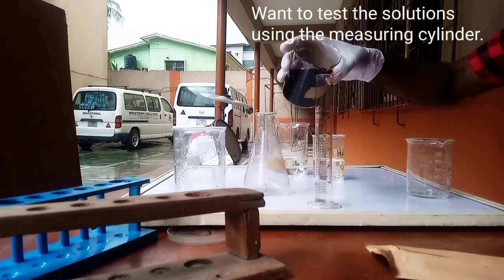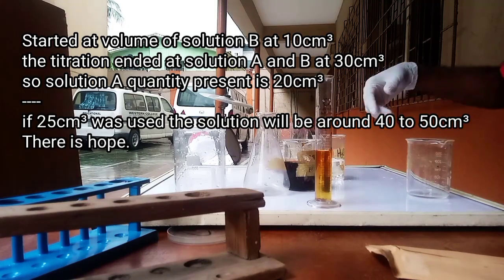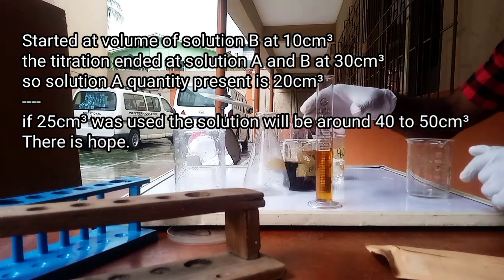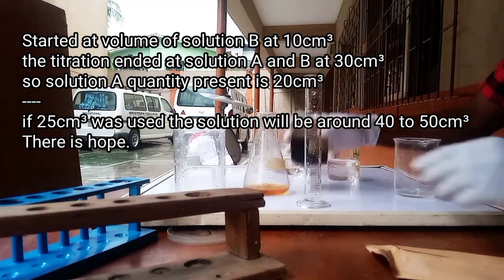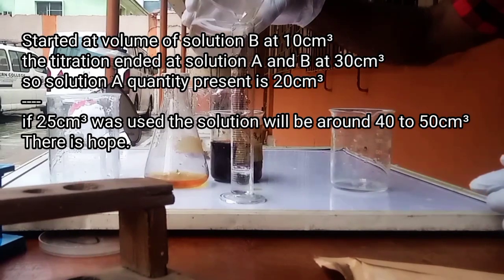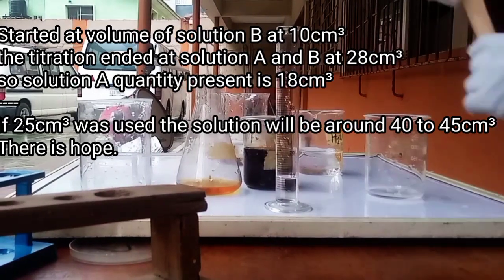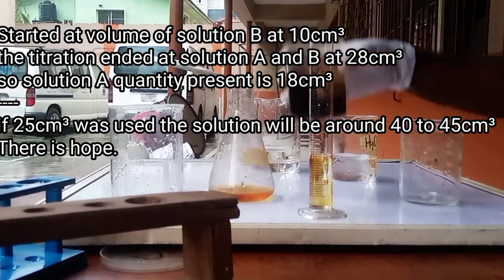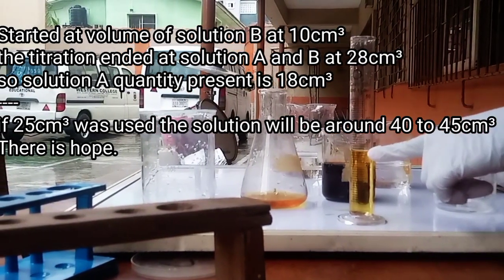I need to just get some of the iodine solution into a beaker. Thank God it is a colored chemical, and the other one is a non-colored chemical. Therefore, I will not have problem to know which one is solution A and which one is solution B, since we know that the dark one is solution A and the colorless is solution B. I dropped that far away so that I will not make a mistake by hitting it and lose the chemical, and also shake this and add it to a beaker. And I'm having two beakers representing solution A and solution B, where solution A is the dark color and solution B is the colorless one.